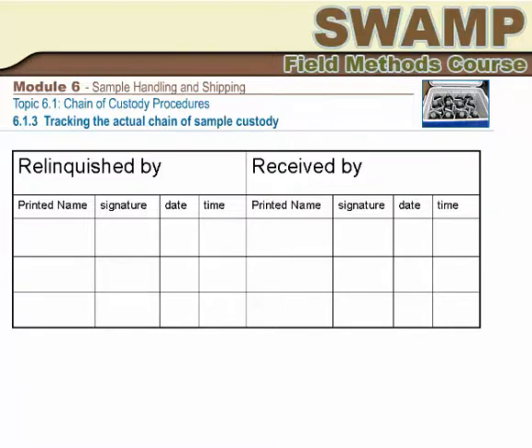Find out how. In many cases, the coolers themselves are wrapped by field personnel in a seal of custody tape. An intact seal proves that samples have not been tampered with, and only the receiving lab may break it.